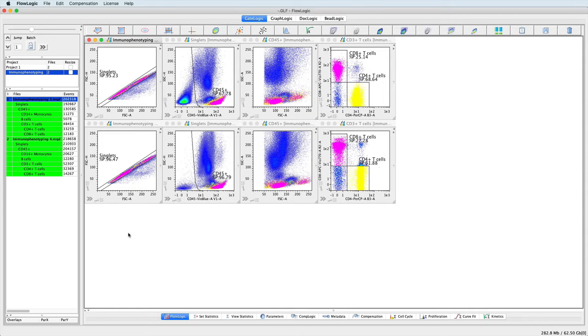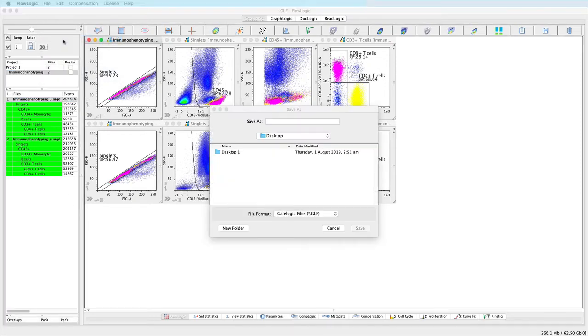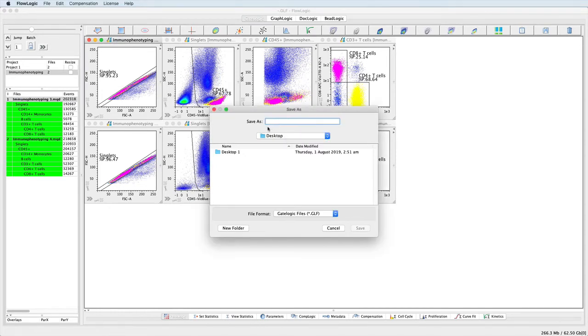To save an analysis, click on File and Save As. This will bring up the Save As window, where you can choose your location and type in a file name.